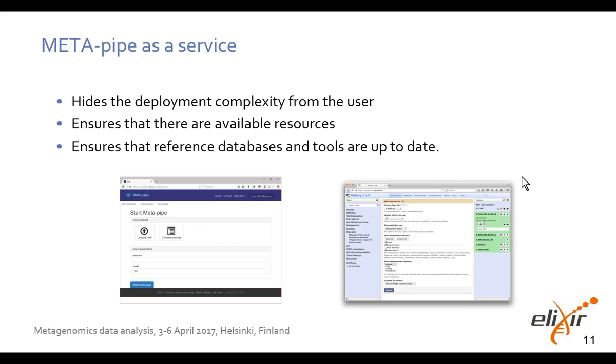First of all is the web interface that you can see on the left, which is the one that you will be using during this course. And the second interface is the Galaxy interface that you can see on the right. And the left one is still a bit in beta. It's not publicly available, but it will be available for this course.